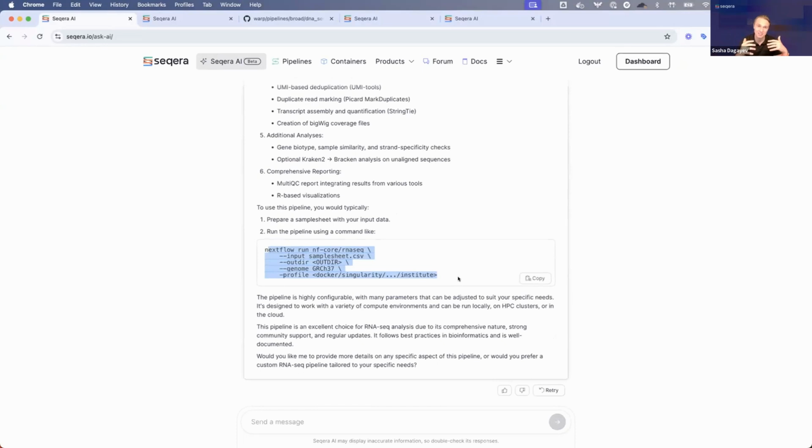The main reason for this is because we expect that a lot of novice developers, the folks that just aren't as comfortable yet and want to use AI for a lot of their developer experiences, well, they might not know that these pipelines exist. And this is really where we want them to start. We don't want folks going out there and building a bunch of custom pipelines when something that is well maintained and well documented exists out there.